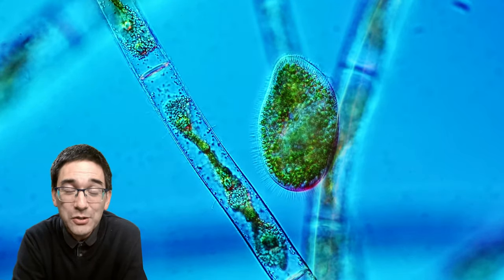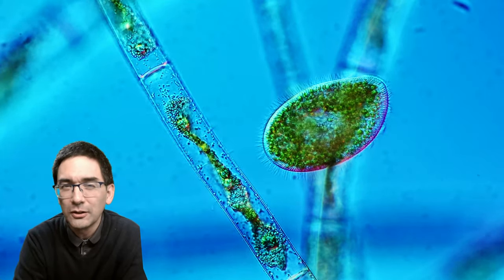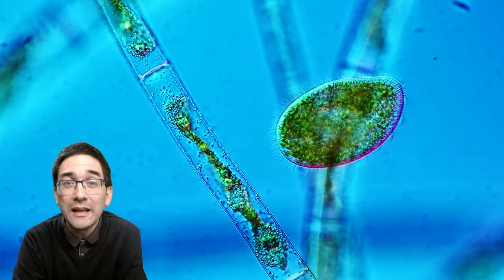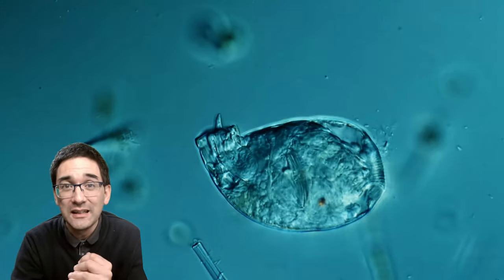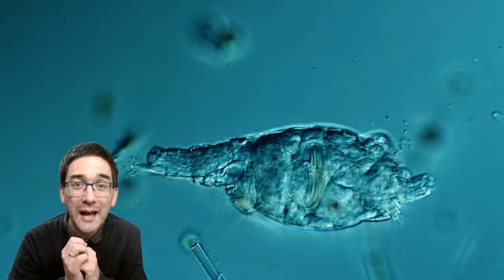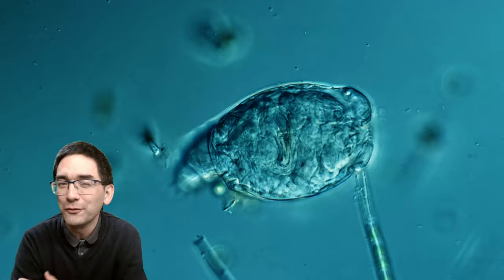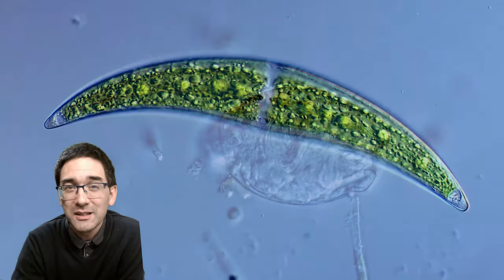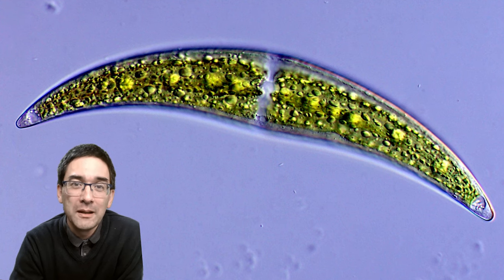This next interesting one is a ciliate. Normally ciliates are not green, but this one is. At first I thought it had eaten some green algae, but the concentration of those green round structures is quite high, and I think these are so-called endosymbiotic algae living inside the ciliate. And this here is a classic — a rotifer, a multicellular micro-animal, quite distinct from the ciliate, even though the size difference isn't that big.